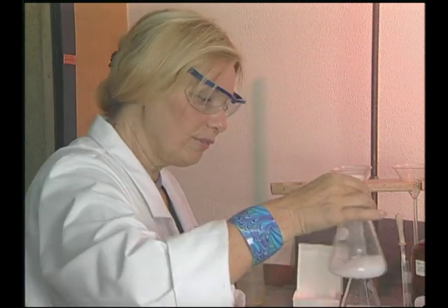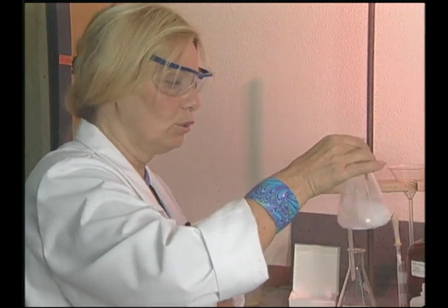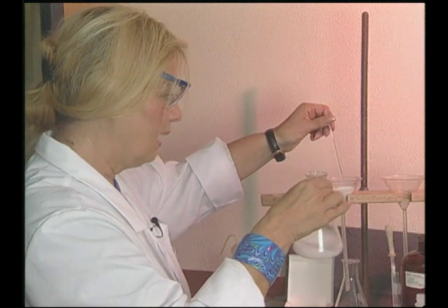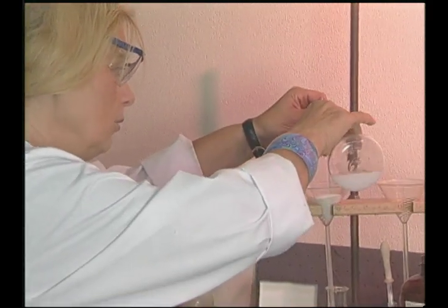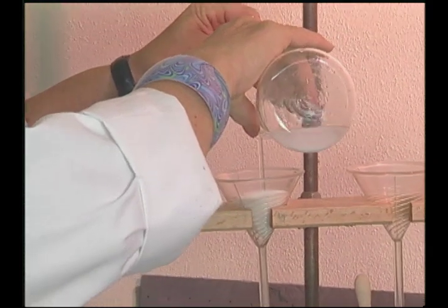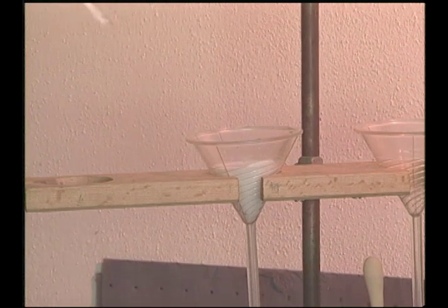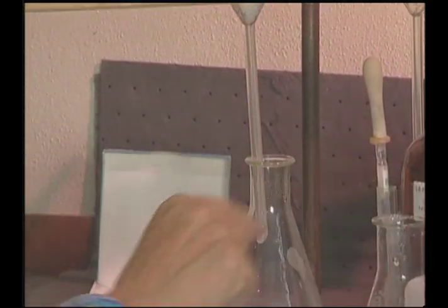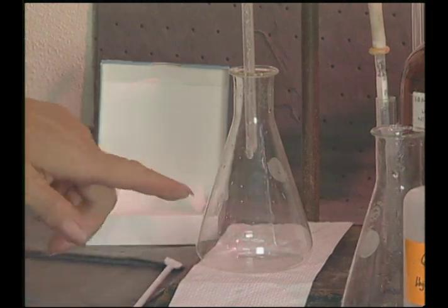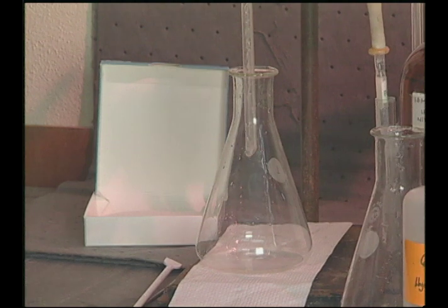And then we have to swirl the solution and use a glass rod as a guideline for the liquid to flow over neatly into the filter. And then you see the filtrate dripping through into the receiving vessel, which is also an Erlenmeyer flask, and it should be completely clear.